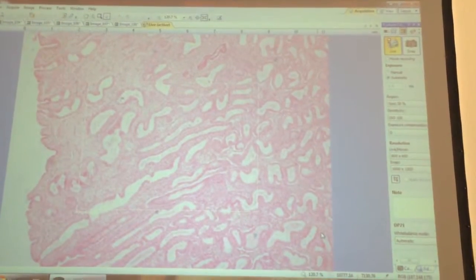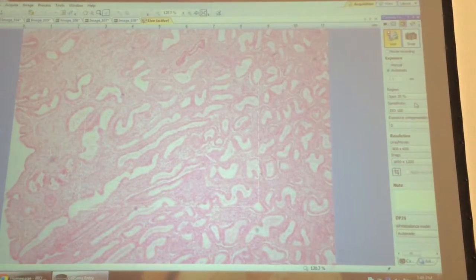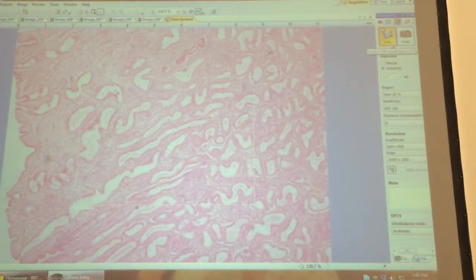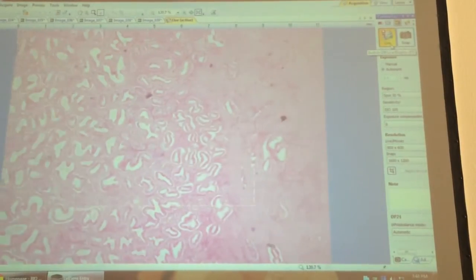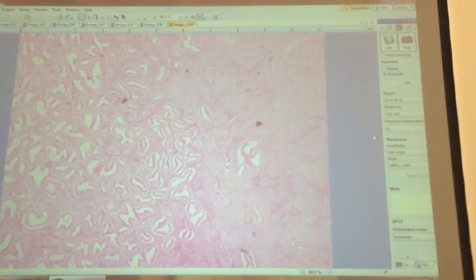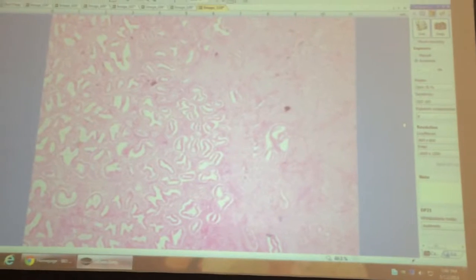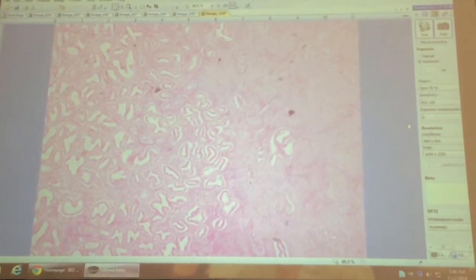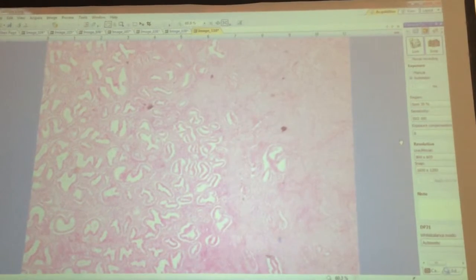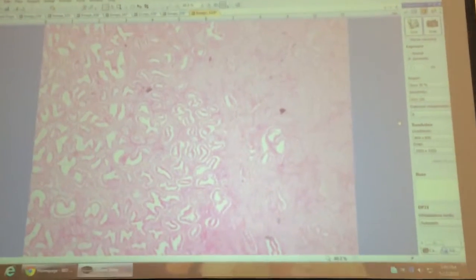And you'll see that, I'm going to take a picture right here. Let me do it this way. Okay, so that's one, and then I'll take it back in here. Now look at how kinked the glands are at that point, right in there. Okay, so those two I'm going to put back to back up on D2L. That's a continuation of the same slide, and that's how long the endometrium becomes in that secretory phase. Sounds good. So you could compare the two together, the proliferative and the secretory.